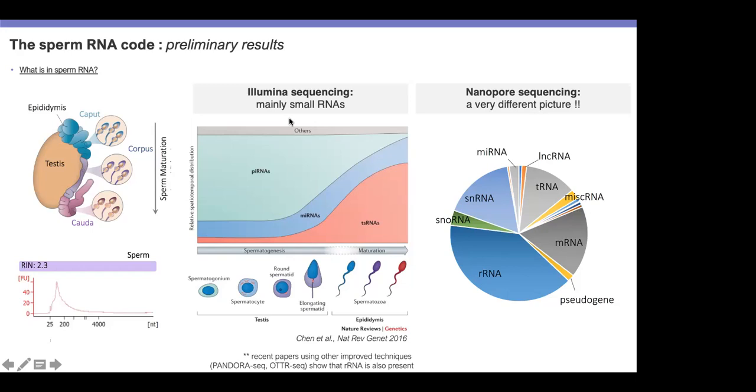So basically those will not cause a problem, because if your data is noisy, they will be equally noisy, if that makes sense, right? If you think about where these errors come from, they usually come from a base calling algorithm that has a model that maybe is not doing well in that specific region. For example, wherever it has, I'm making it up, 7 As, which is a typical example because it struggles with homopolymer regions, it will always put 6 As. So it always has a deletion there, right? But then this same error will be present in both your samples. So then you can subtract them, and you will see whatever is different between your two samples in terms of errors, which in general tends to be much more true positives of modification changes, right?